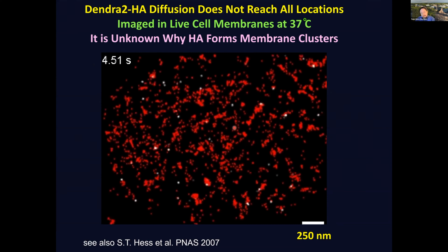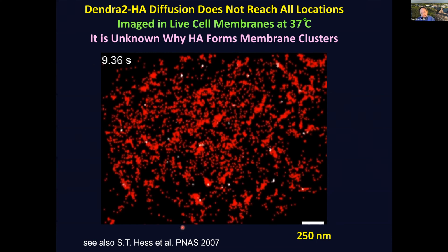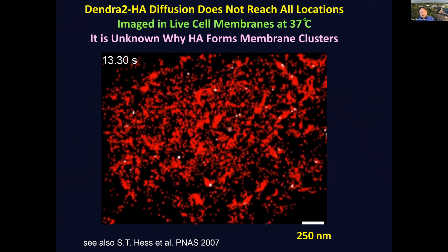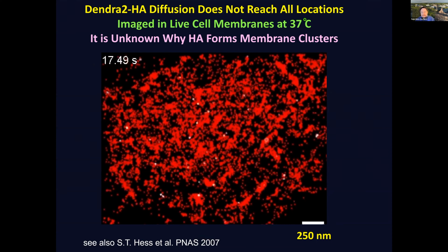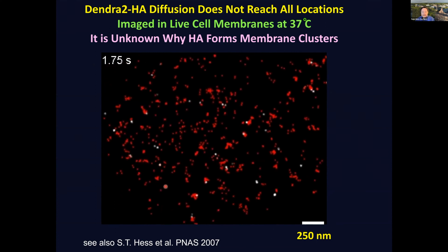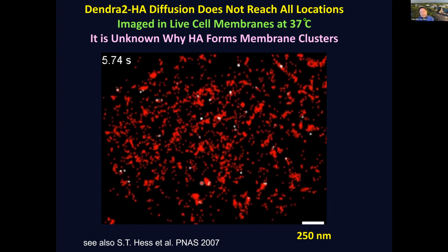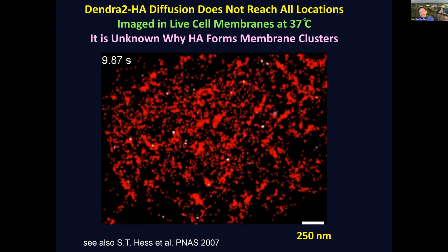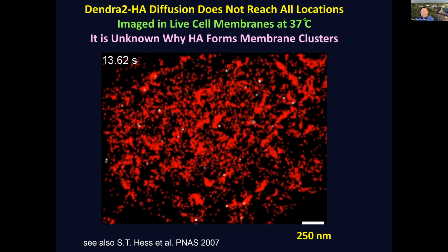Looking in live cells, we could see something intriguing. And I would mention that we were the first to do localization microscopy in live cells in this 2007 paper, where we saw that HA was confined to these elongated regions and doesn't go into some regions of the membrane, even though there's plenty of mobility and time for the molecules to reach those locations. Why did they not go in some places? And why are the places they go elongated in shape?